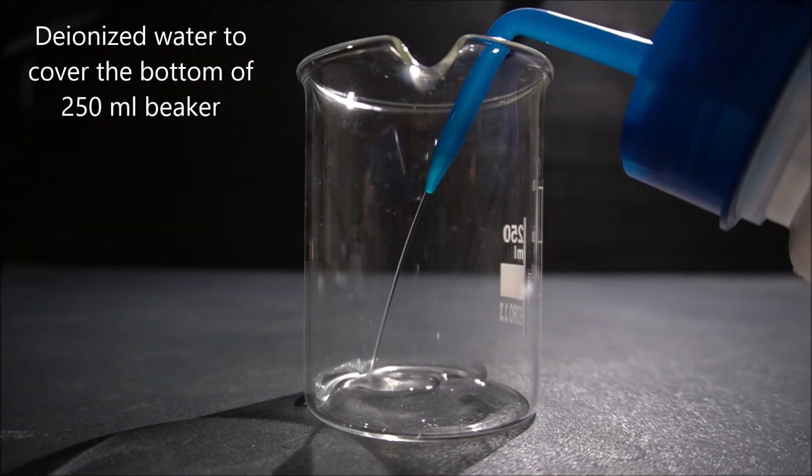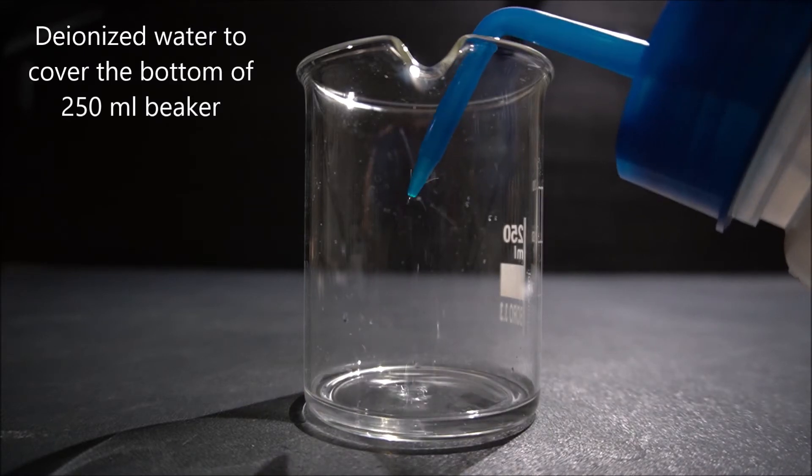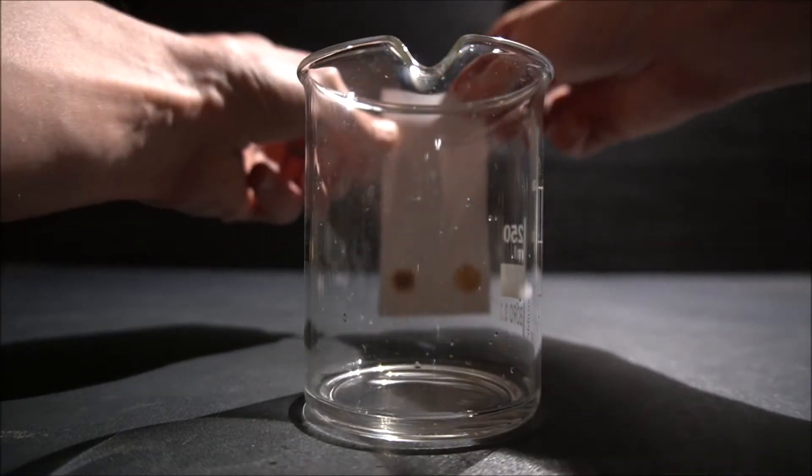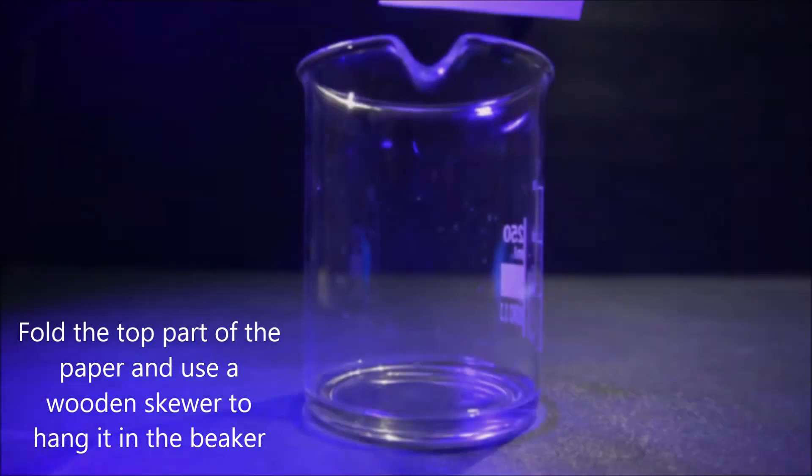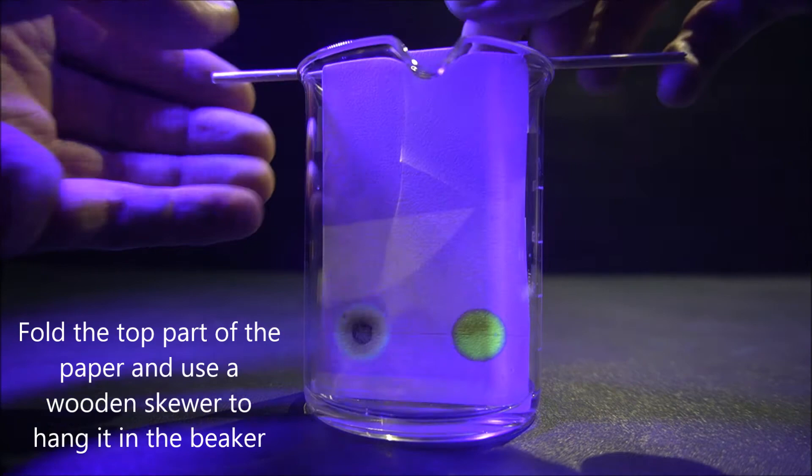Add just enough distilled water to completely cover the bottom of a 250 milliliter beaker. Fold the top part of the paper and use a wooden skewer to hang it in the beaker, with the bottom edge just immersed in water.